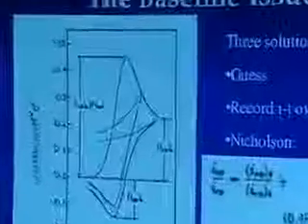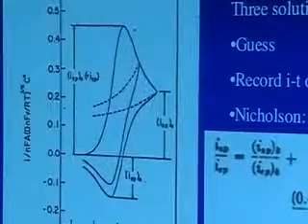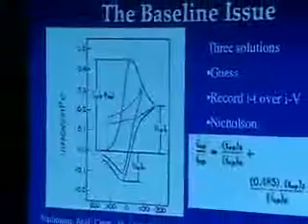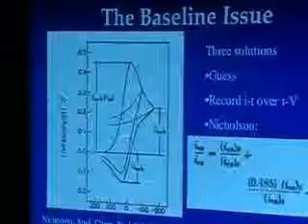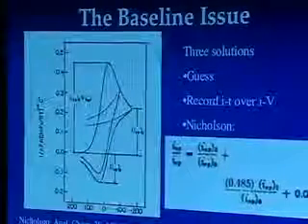The challenge comes in determining the peak current over here. So for example, if I'm using that third diagnostic, which is the ratio of I anodic over I cathodic, I have to measure both of them. There's no way around it. And the challenge is, how do I get my hand on that? It's very easy to see when you flip open the cyclic voltammogram, that is, make this a time axis instead of a potential axis, shown by these dashed lines here.